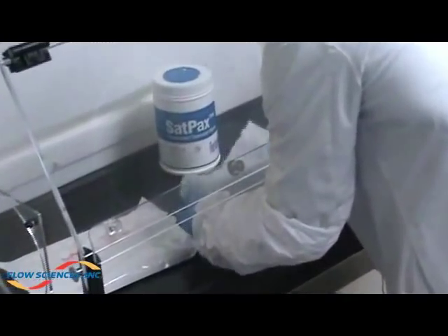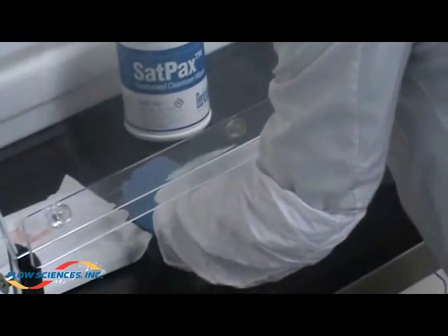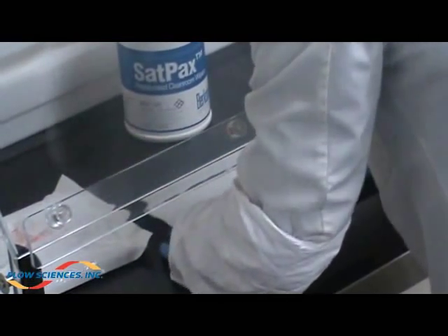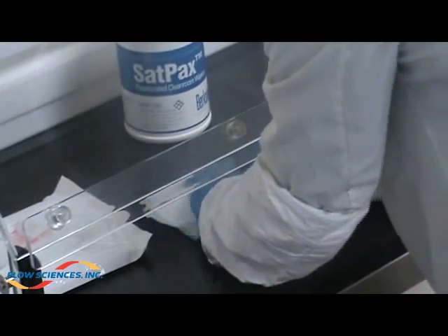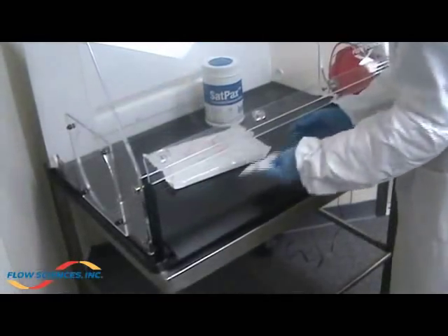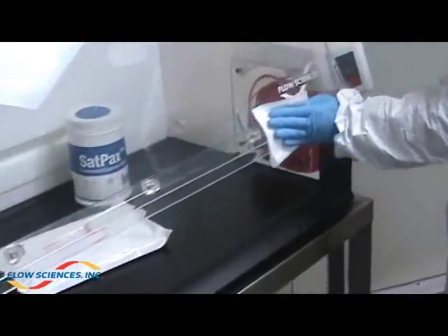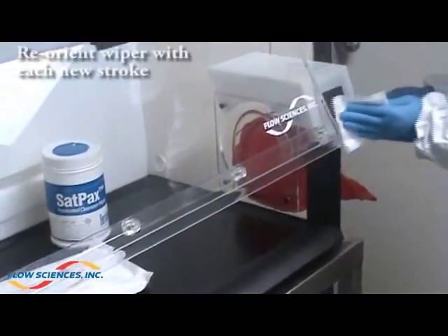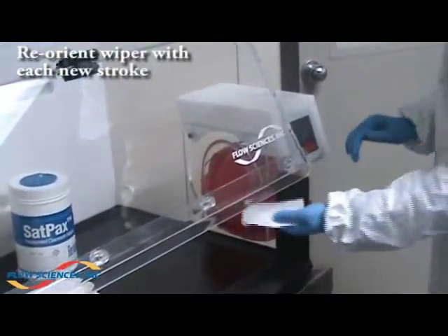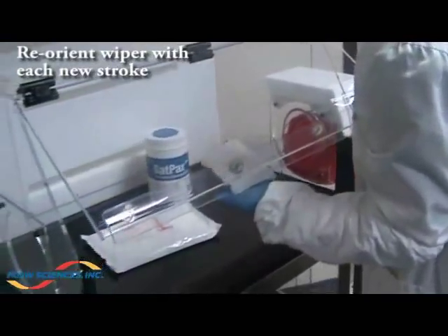Place wiper flat on surface and side enclosure and quarter fold. Work from cleanest areas to the dirtiest. Start cleaning with one single stroke across the front airfoil on the door. Reorient wiper to clean side for cleaning with one single stroke across the back airfoil on the door.